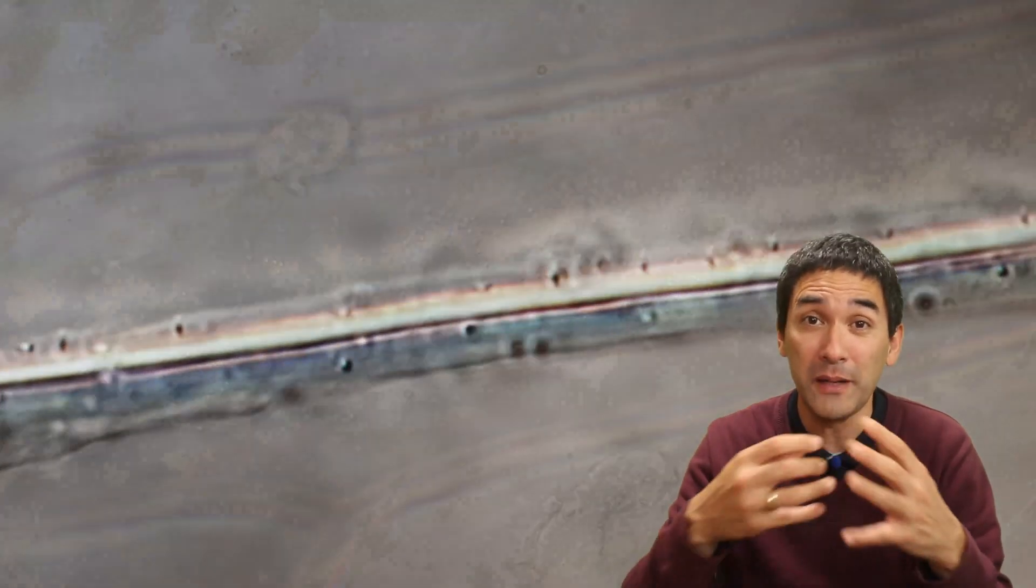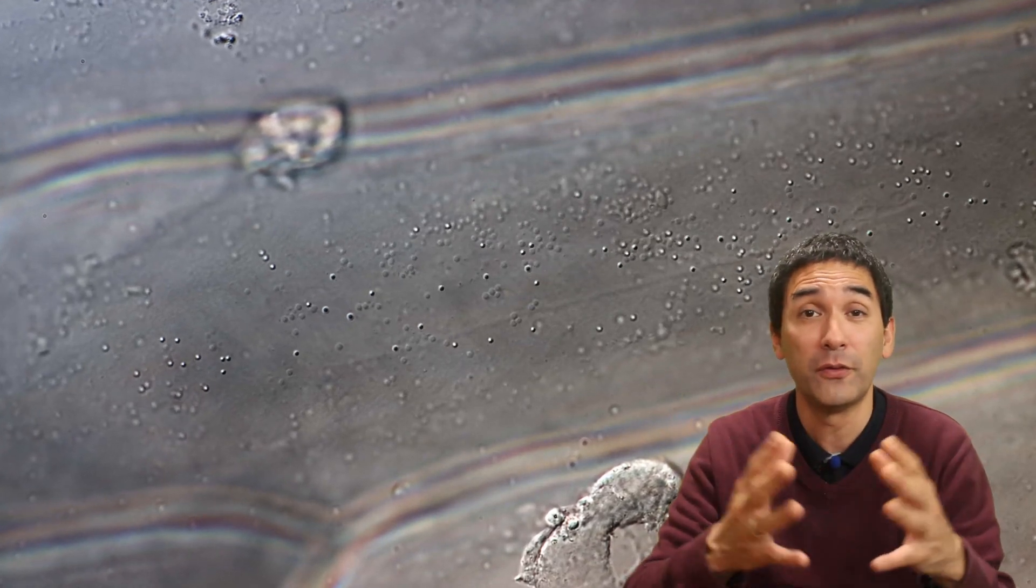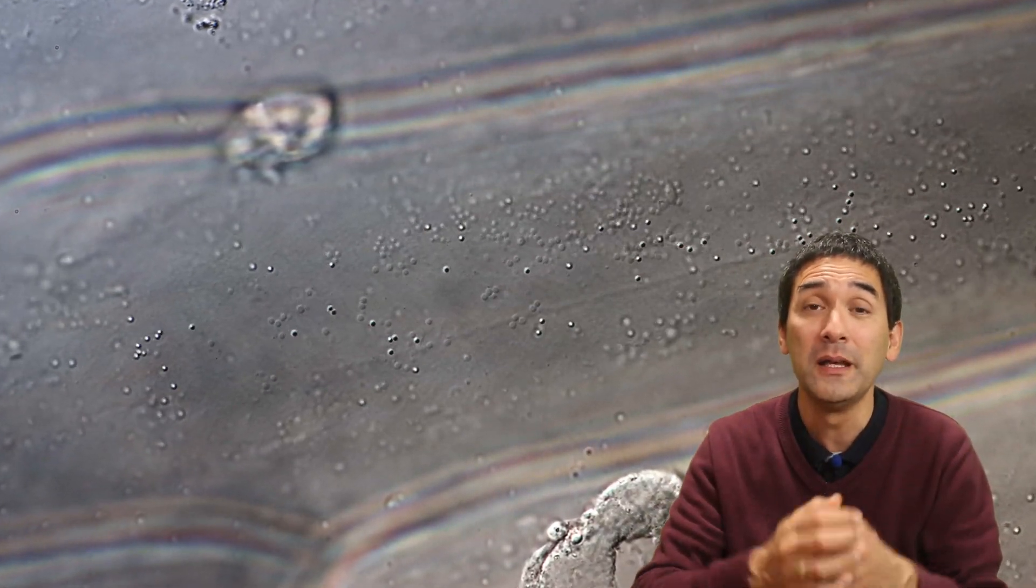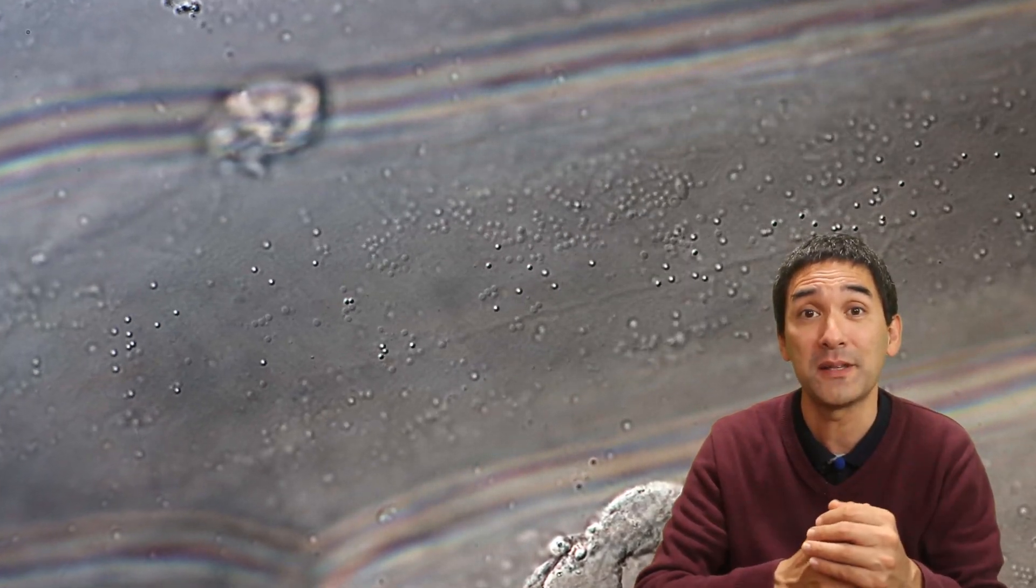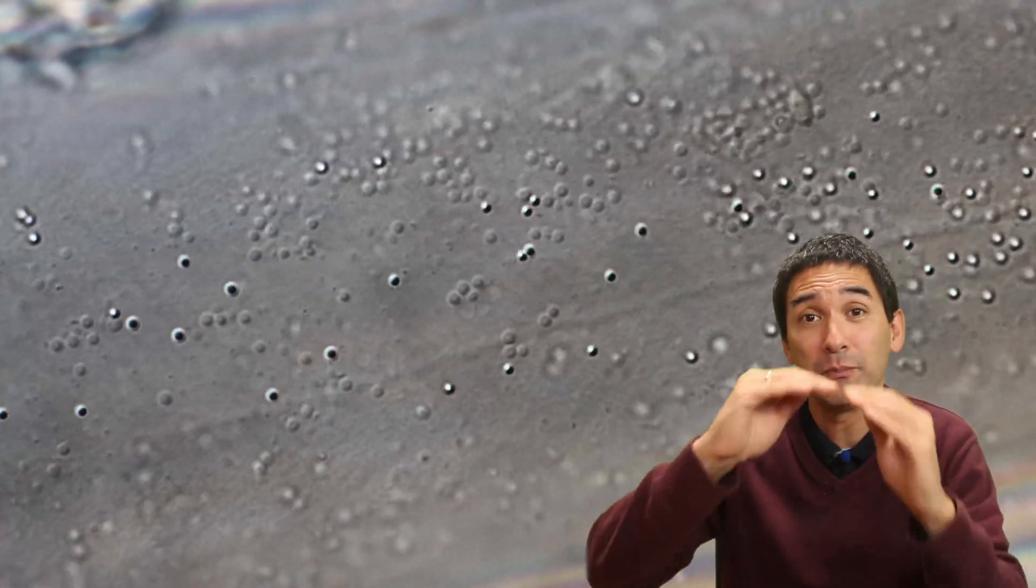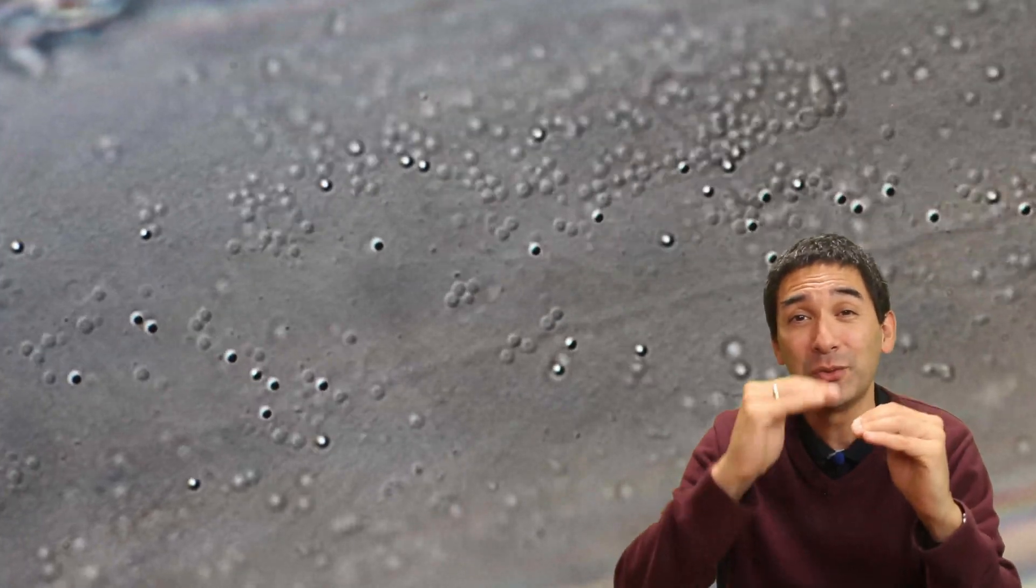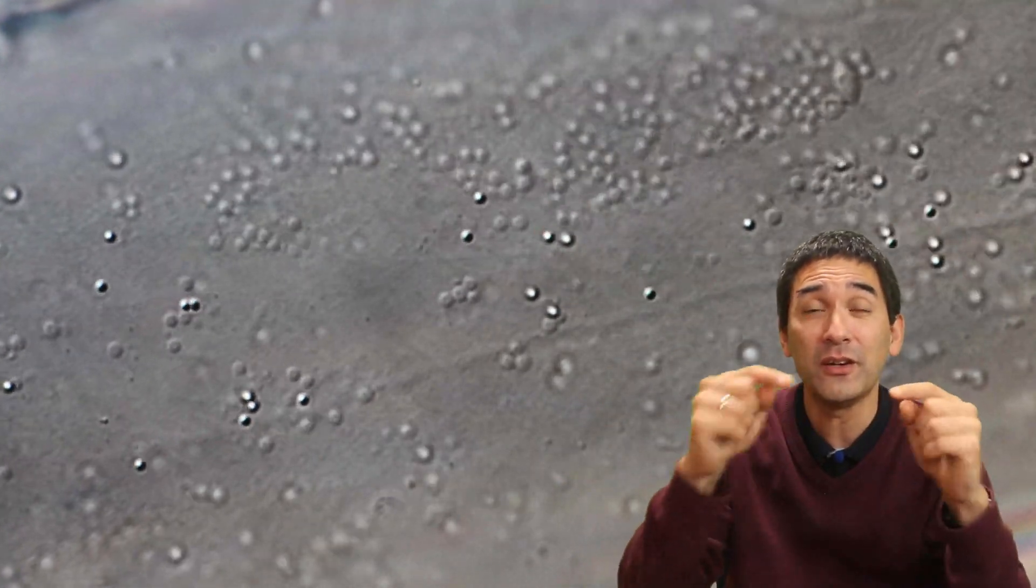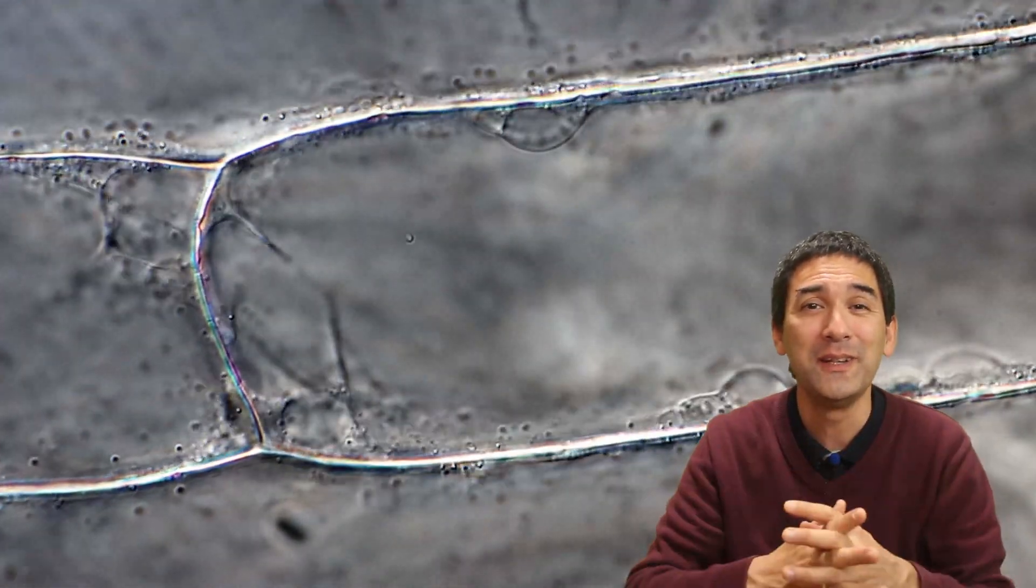I, for example, taken over the course of about five to ten minutes the videos, and then I was speeding it up quite a bit. But you are able to see the movement already without a time-lapse. Here, for example, those vesicles now can be found not on the side but towards the top of the onion. They're still compressed to the side, but I'm having now a top view on those vesicles.